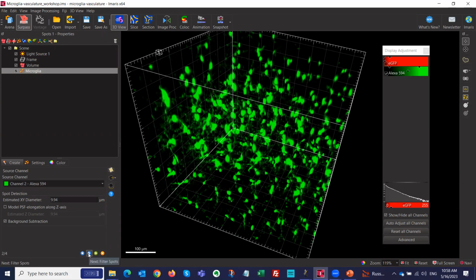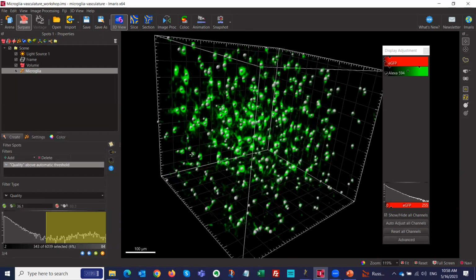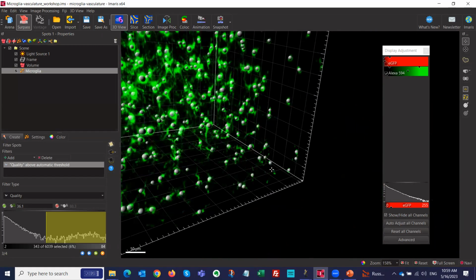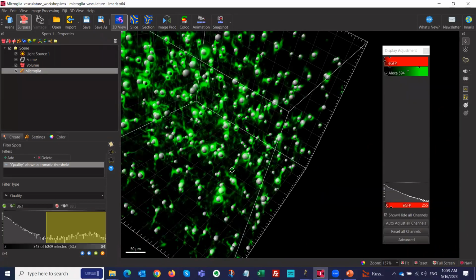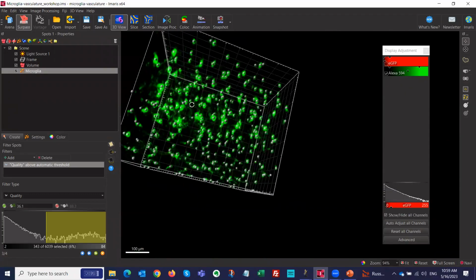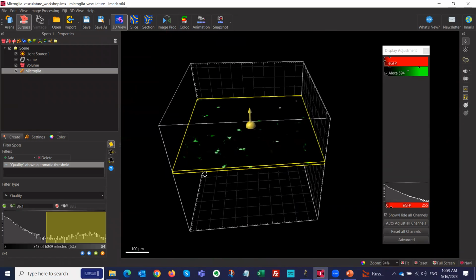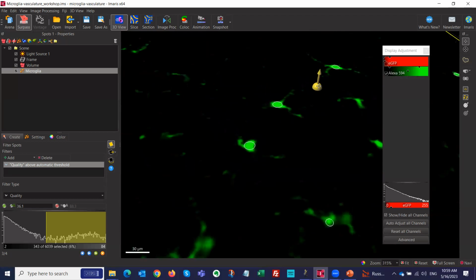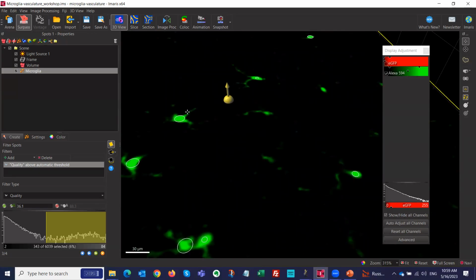So going to step 3 out of 4 by clicking next, you can see here, if I rotate, it placed the little spots now into each of my microglial cells. Okay, see them here. You can do a quick check to see if it got each of them. You can also go with the spots into the 2D view and check this one. It didn't capture this one, but maybe in a different plane. Yep, it is here. Okay, this one, same, a different plane.